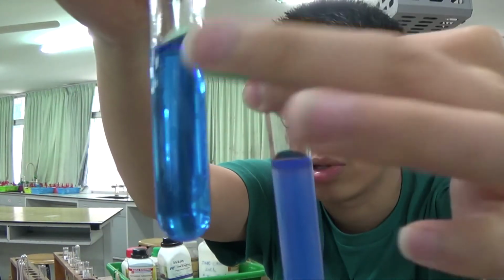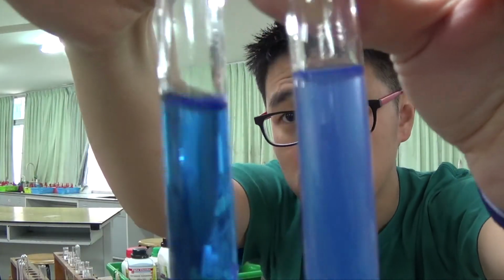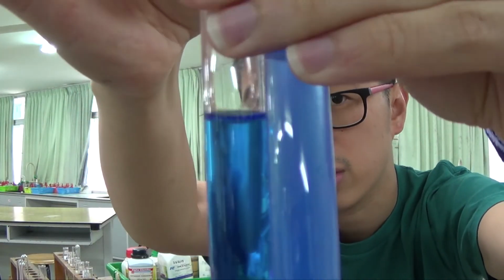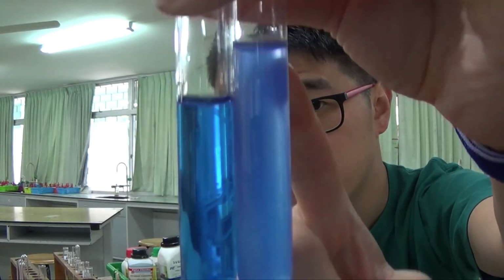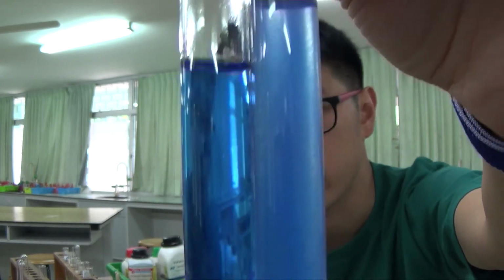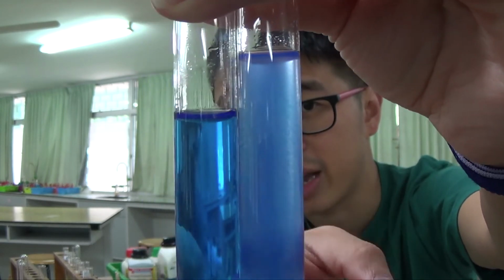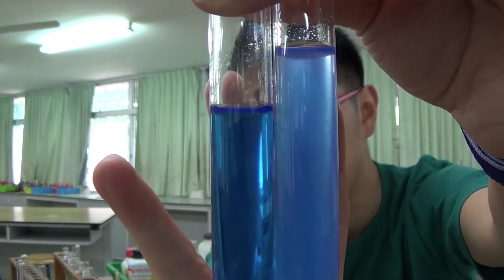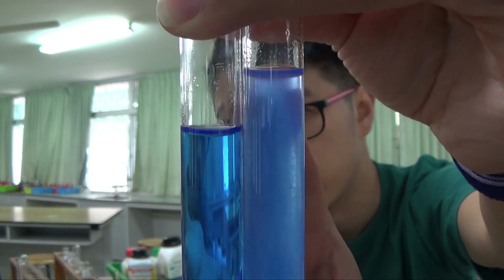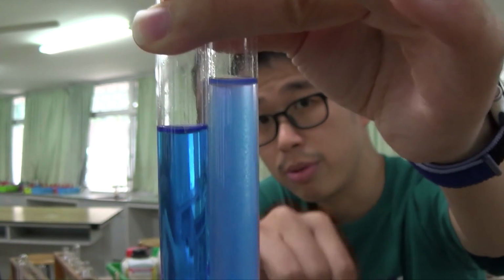This was the deep blue solution, the dark blue solution in excess ammonia. This is in excess NaOH. You see the difference? Solution on your left, this is in excess ammonia. Okay, this is a deep blue or dark blue solution. On the right, this is in excess NaOH, the precipitate, because you see it's a suspension. Okay, so in excess NaOH, the precipitate remains insoluble.